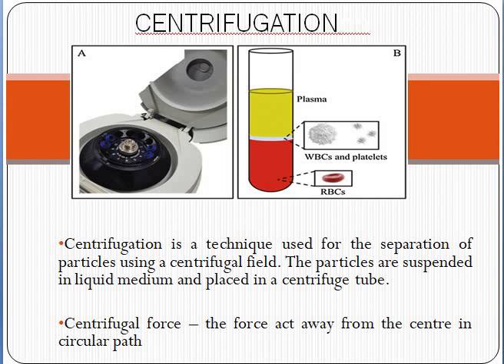The force which is used for separating the compound from the mixture is called centrifugal force. That is a force which is generated because of rotation. So this centrifugal force generating machine is called a centrifuge, and the process is called centrifugation.